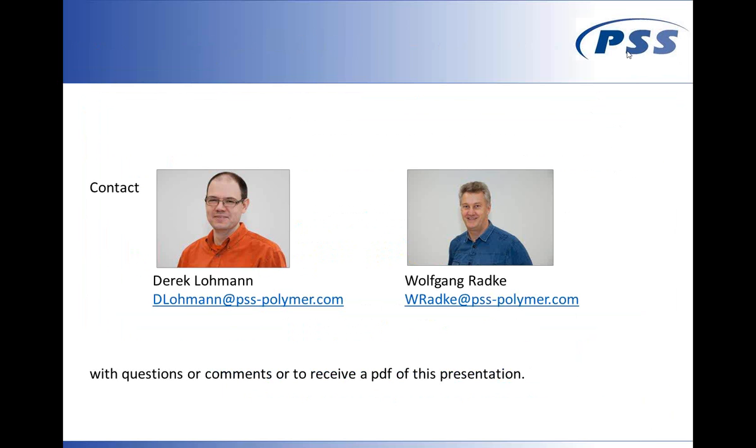Another comment: the fact that you have established critical conditions does not automatically mean that you get a separation by end group functionality. Keep in mind, you can only expect a separation by end group functionality, for example, if your end groups are stronger adsorbed than the repeating units. So you really have to think about how to select the stationary phase according to the problems that you are investigating. I hope this answer helps you a little bit at least.